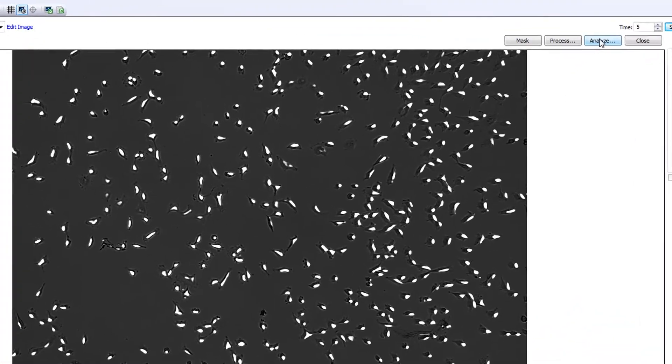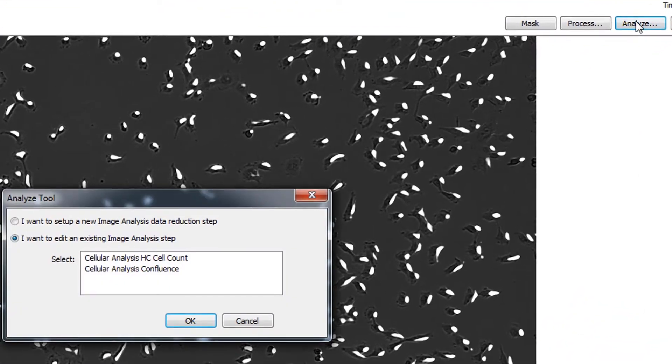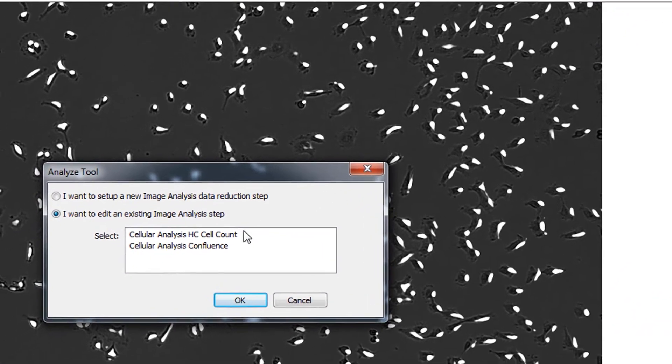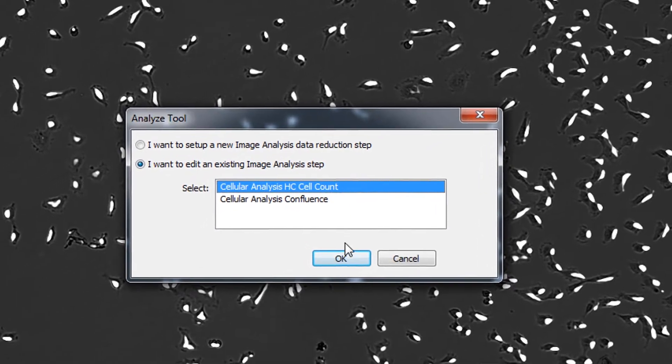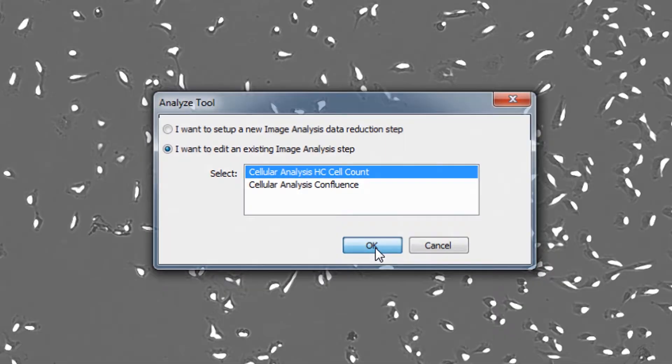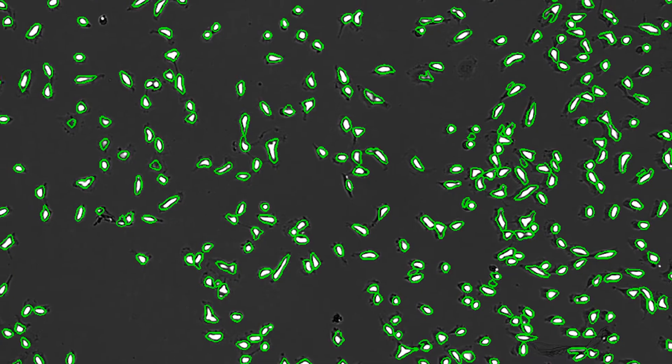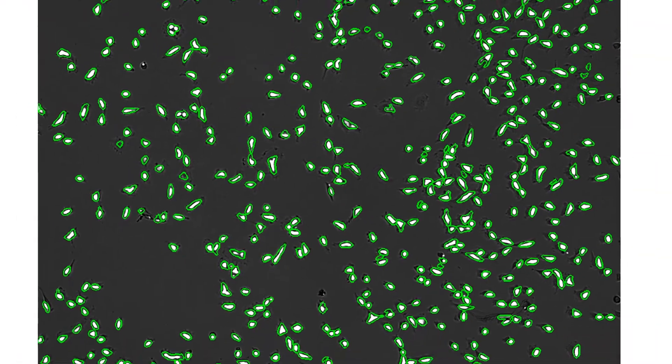Gen5 software identifies cell objects automatically using defined intensity and size thresholds to draw masks on the objects.